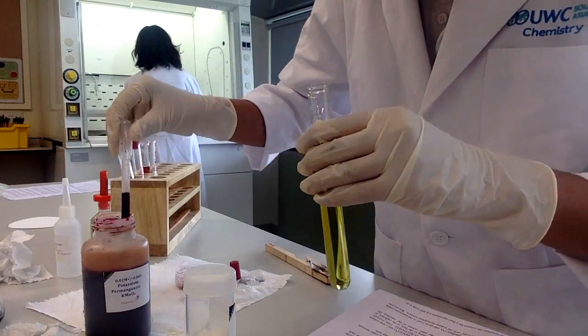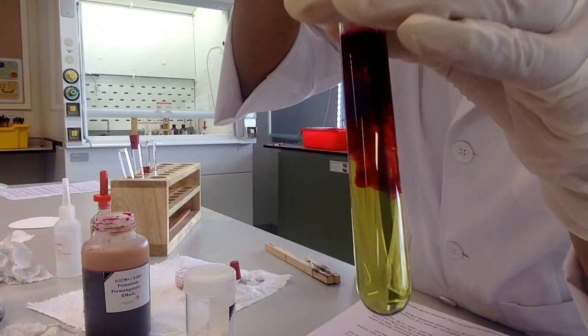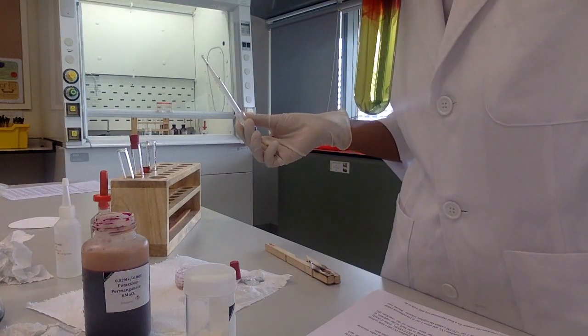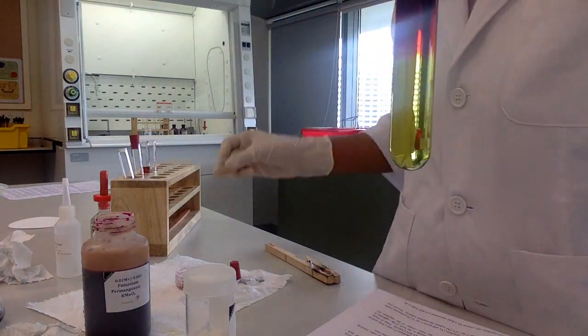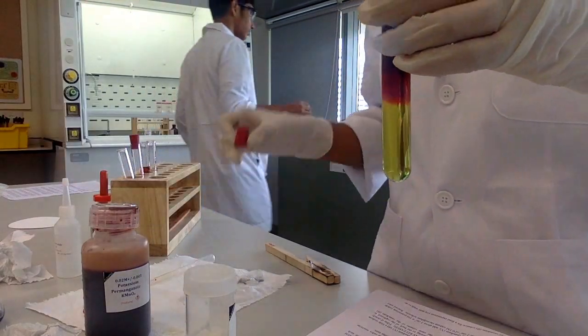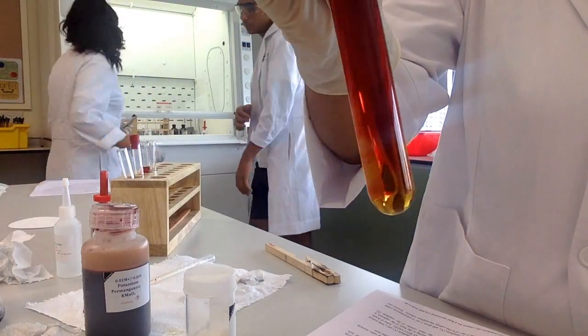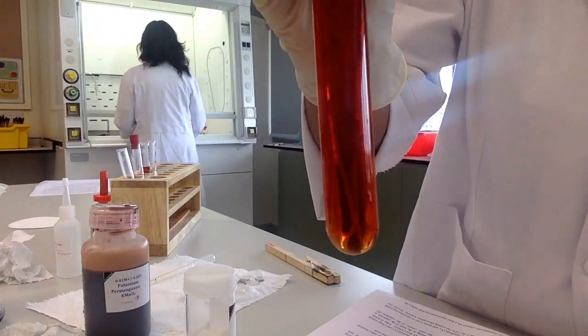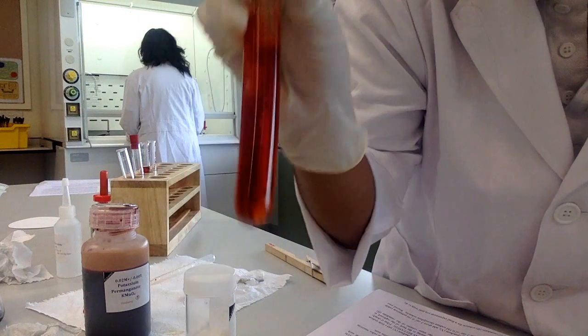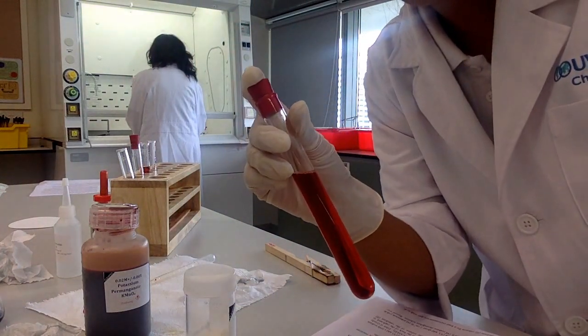What did you add to it? I added it to a solution — violet. I added it to violet. You actually oxidized it to what color? Two plus. Yeah, I did.